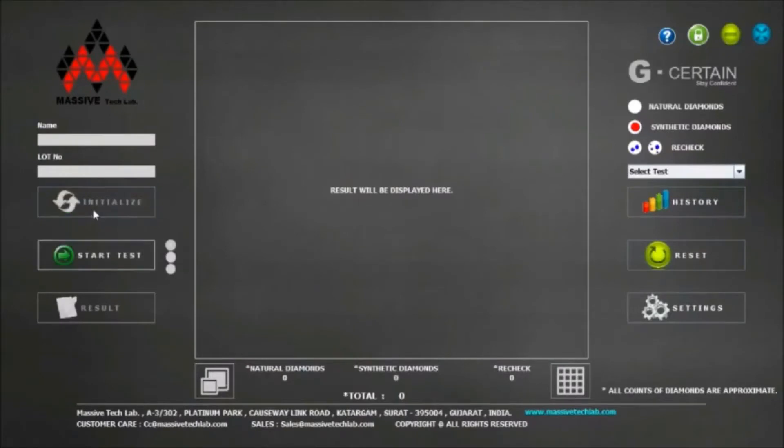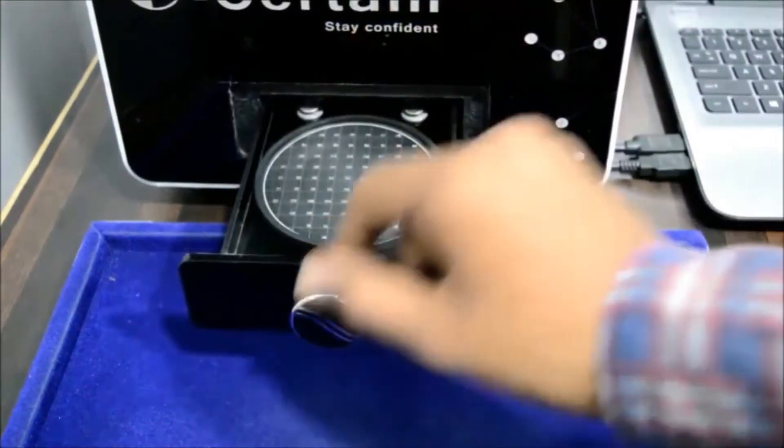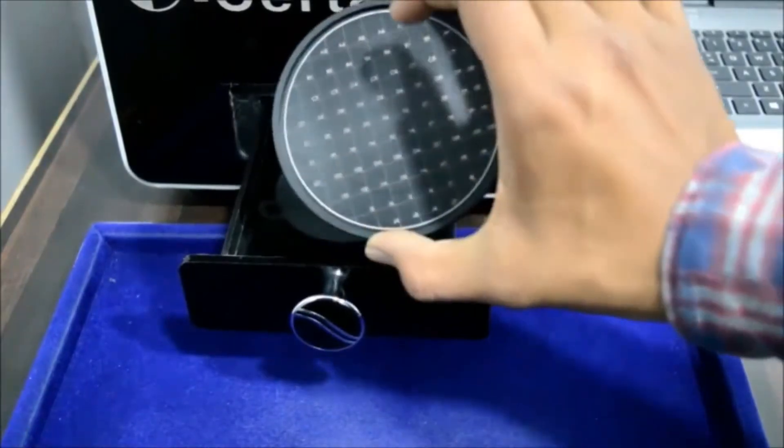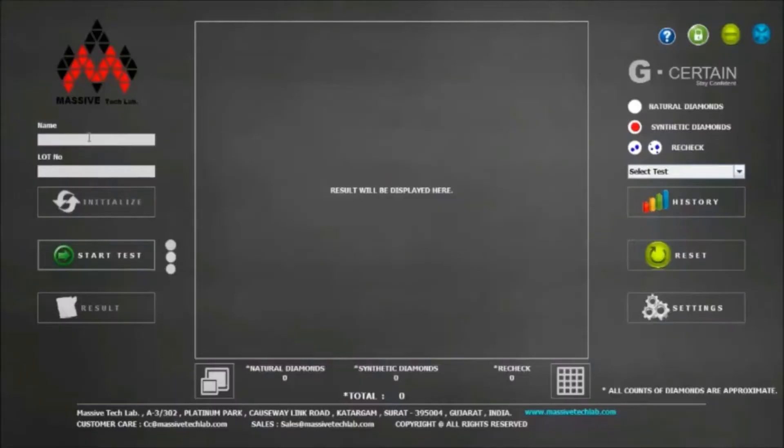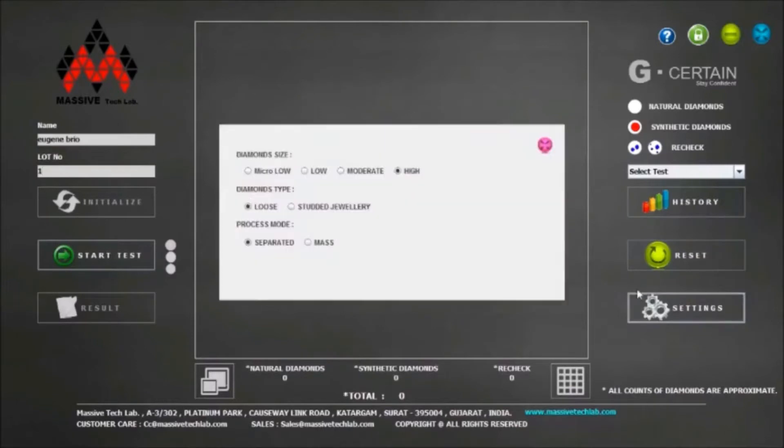Arrange diamonds in circular tray. In software, add the name and lot number in text box provided below logo of Massive Tech Lab. This naming and lot number will be helpful in searching result history which can be useful afterwards.